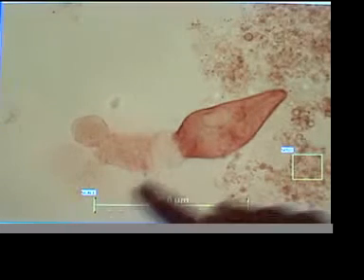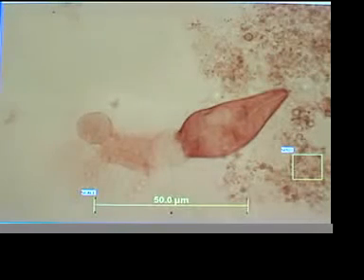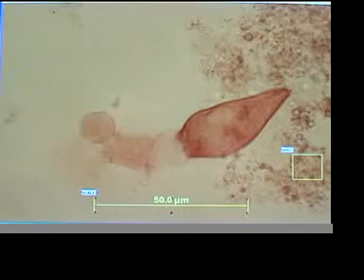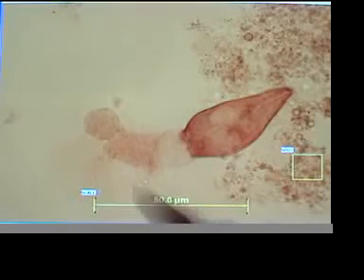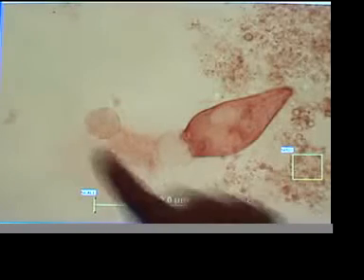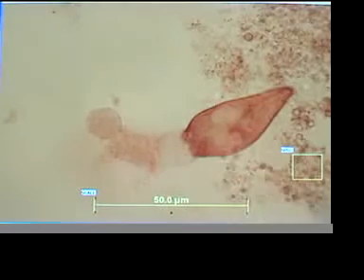Notice here the tiny little spheres, which could be what's called the pearl chain effect. We do see that fairly commonly in these devitalizations. Yeah, something's continuing to happen here, so this is fairly recent. And I think he's trying to decide what he's going to do.